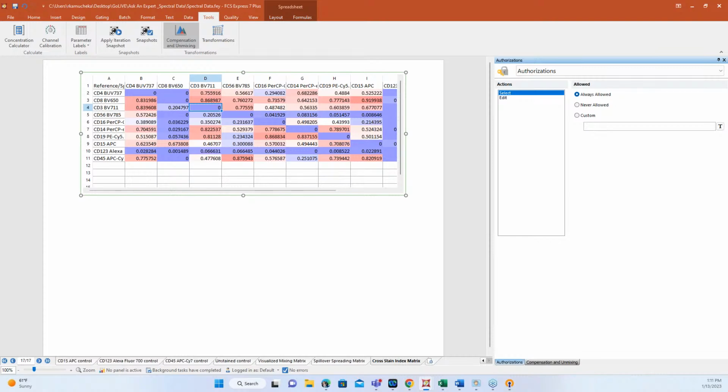We've just created some thresholds that show you some colors to highlight what's changing and what's not. Again, you get to make the final call. This is not saying that something is wrong and you need to throw your whole unmixing out the window. It's just an indication that you might have a little more spillover here. But if they're on two different cell types, what does that really mean? So just be mindful, know your data, and trust the process.